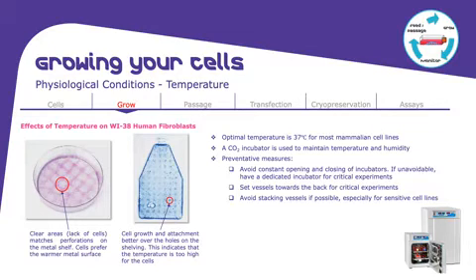Here is an example, as you can see below, when the temperature in the incubator was wrong. If you wonder what the first image, with a little bit of a reddish color, looks like, it actually looks like metal bars in the incubator. It was so cold in the incubator that the cells were hiding on those metal bars. And the second image, which is a little bit bluish, is exactly the opposite reaction. It was so hot in the incubator that the cells were trying to hide in between those metal bars.